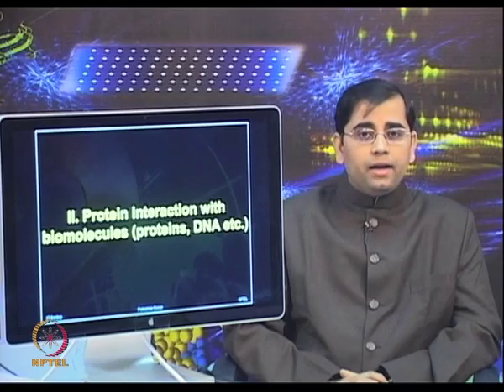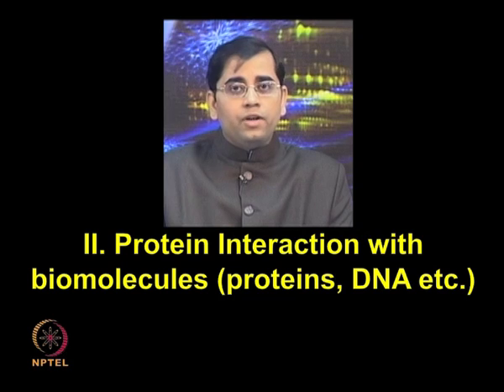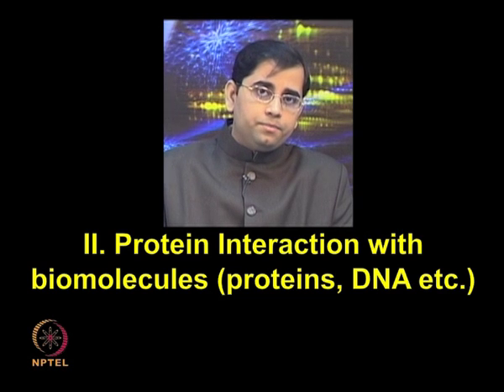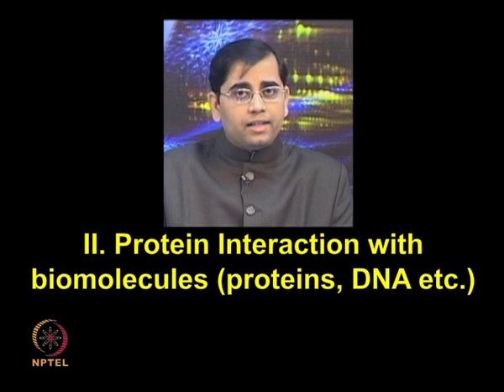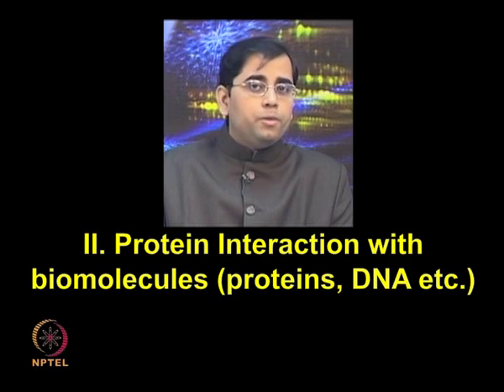Now, let us look at another application, protein interactions. Again, this is one of the very widely applicable and widely used assays on the protein microarray surface. Different types of interactions including protein-protein, protein-DNA as well as with other biomolecules have been probed on the protein microarray surface.